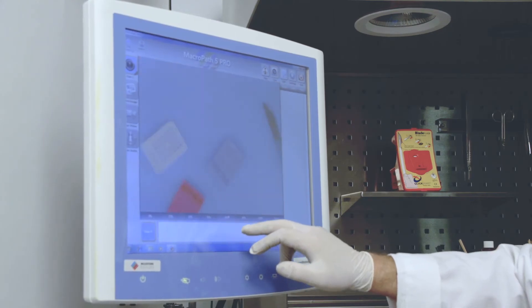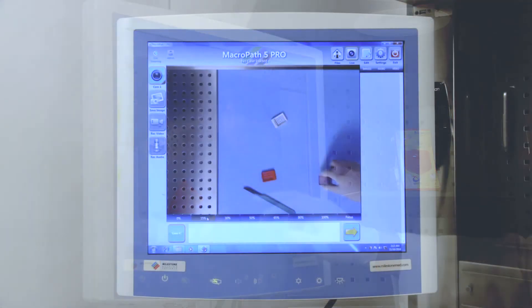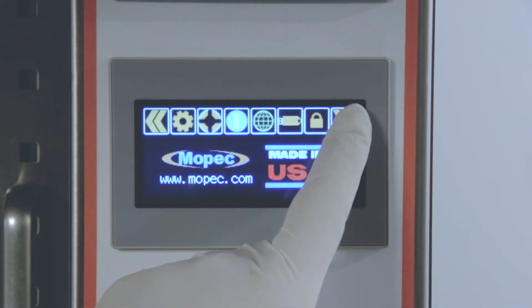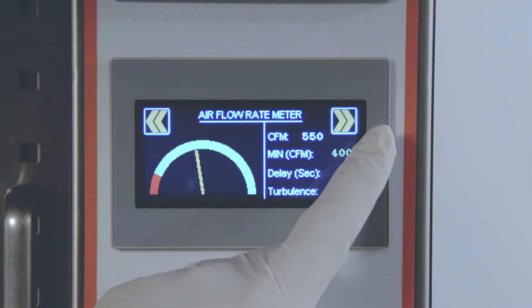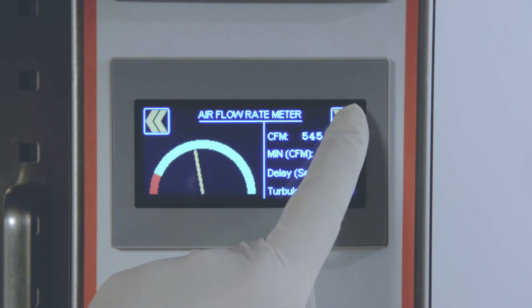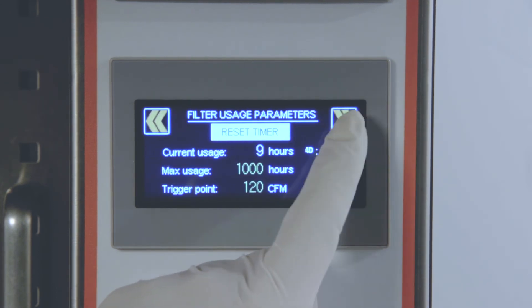The workstation can be ordered with the Milestone Macropath X factory installed, or an imaging system can be added at a later time. Airflow, formalin management, and filter usage are monitored with an interactive touchscreen display and customizable alarms based on facility safety needs.